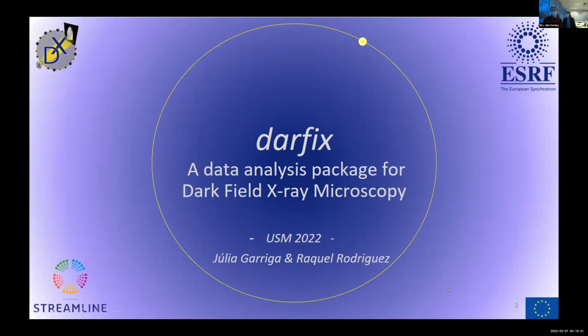Nika Method, and today we are going to present you a data package for the analysis of dark field microscopy, or as we all know it, Darfix.